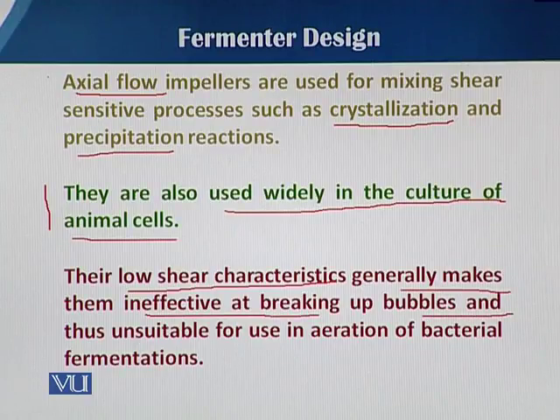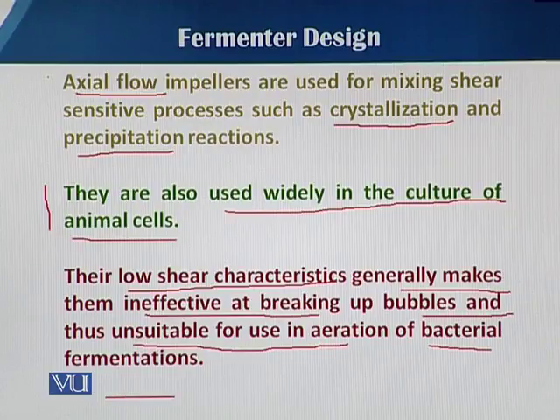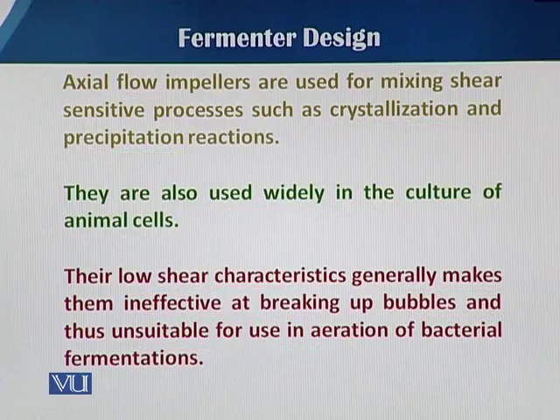As I already told you, axial flow impellers do not have as much shear effect as the radial flow. That's why they are unsuitable for bacterial fermentations when more aerobic conditions are required. So axial flow impellers are not recommended for bacterial fermentations.